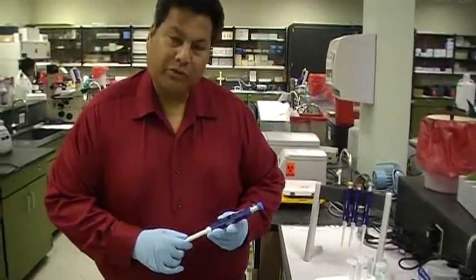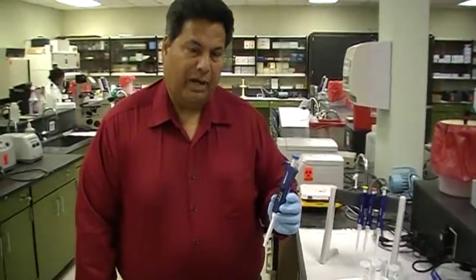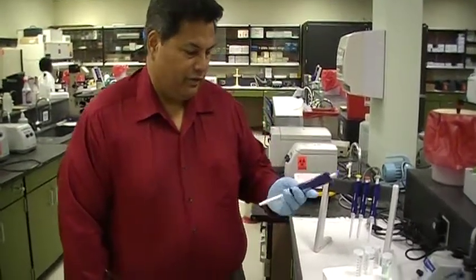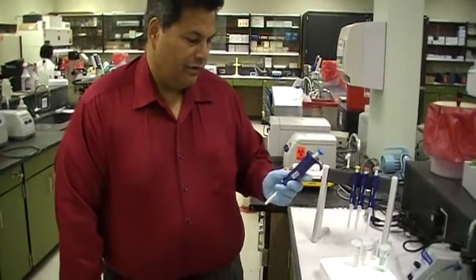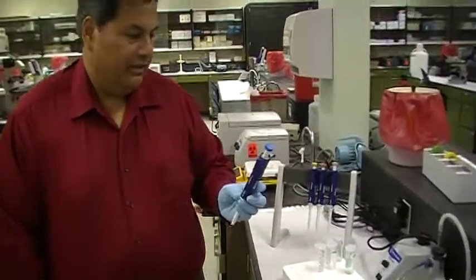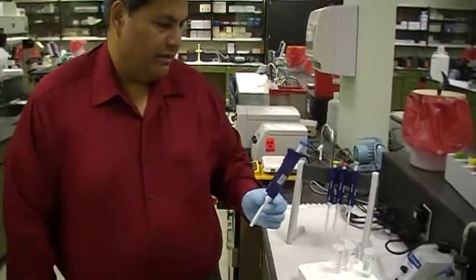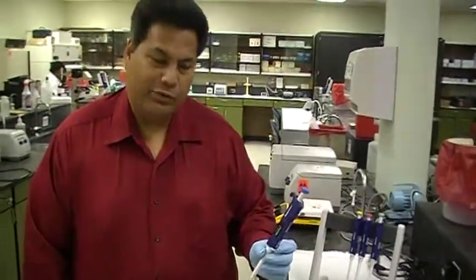This morning we're going to show you how to use the single-channel pipettes. These are very common in the lab, and these are called the Fin Pits, but some labs have the Gilson pipettes. So these are the single-channel pipettes, and we're going to show you how you use them.